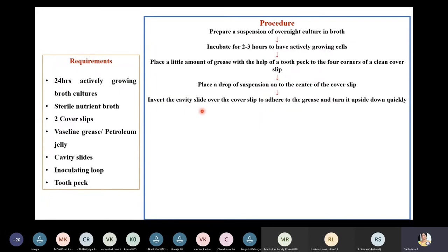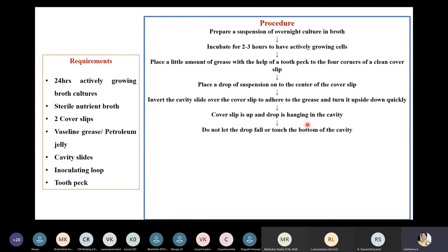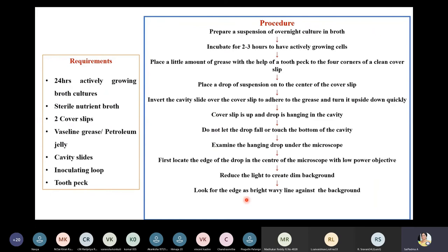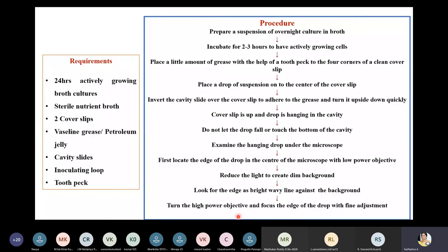Invert the cavity slide over the cover slip to adhere to the grease, and turn it upside down quickly so that the cover slip is on top and the drop hangs in the cavity. Make sure the drop does not fall or touch the bottom of the cavity. Examine the hanging drop under the microscope: locate the edge of the drop at low power objective, reduce the light for a dim background, look for the bright wavy line at the drop's edge, then switch to high objective and focus with fine adjustment.